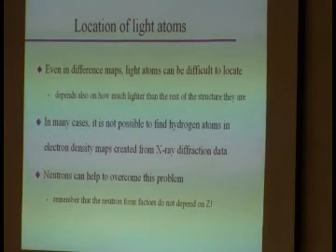Even on these maps, locating a light atom can be really tricky. Okay, and once again, what's a light atom? Well, it depends on what your material is. One thing that is always true is hydrogens are really difficult to find by X-ray diffraction. The reason is X-rays are scattered by electrons, and hydrogen has how many electrons? 1. If it is covalently bound, if the bond is polarized somehow, it has less than 1. Okay? That does not make it easy to locate.